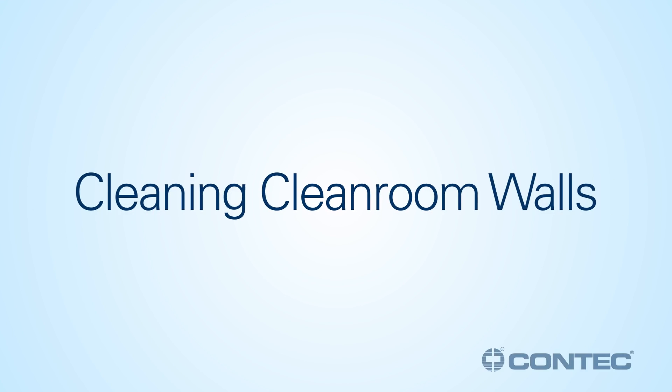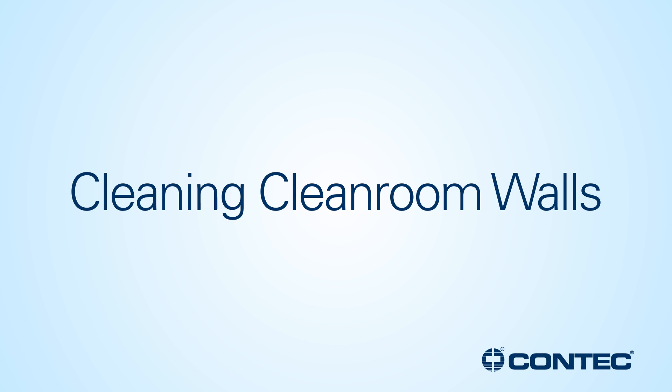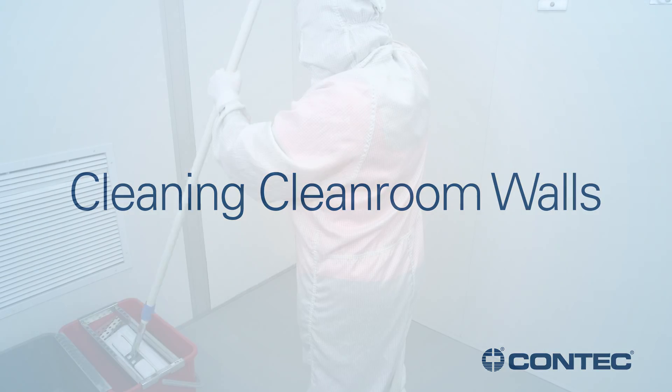In this video, we will demonstrate three methods for cleaning and disinfecting cleanroom walls. Always follow your facility's protocol.